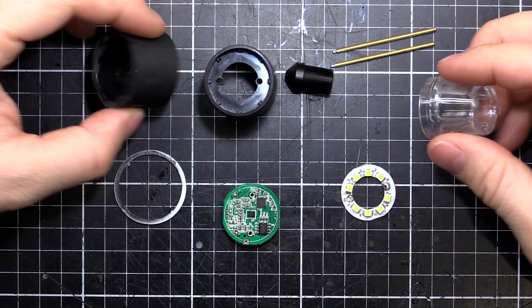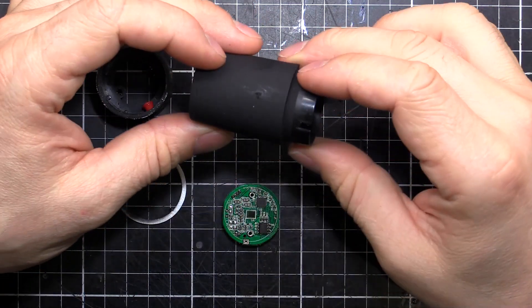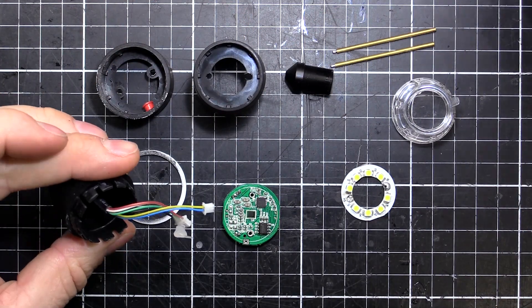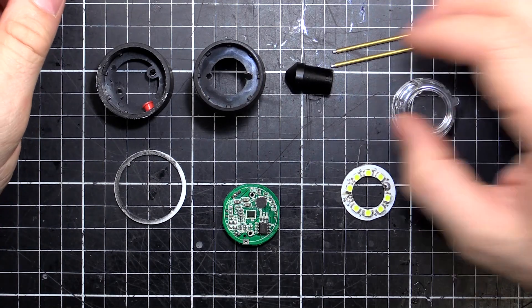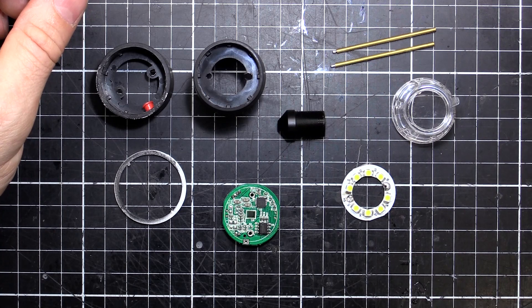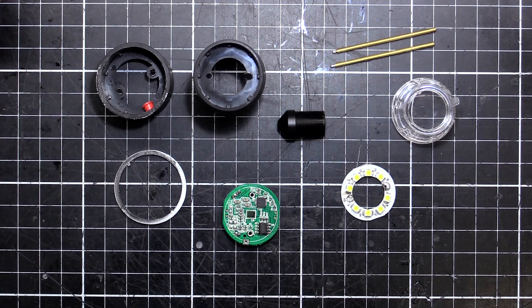So there's a quick teardown and look inside a cheap eBay USB microscope. Might be useful for some parts, but for use as an actual microscope they're pretty terrible. I'm sure they're useful for something though.